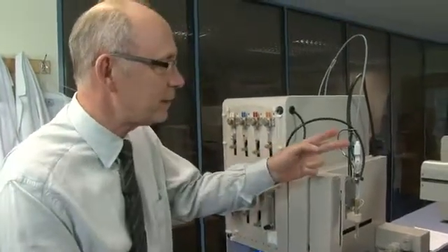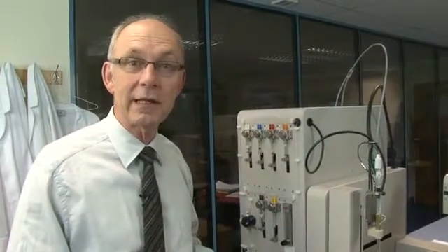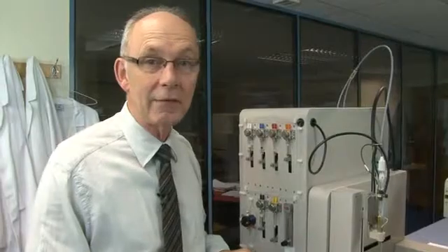We start with this one at the front with the white cap. This is a pH electrode. This is one of the smallest pH electrodes ever made. It's made specially for us and we need very accurate measurement during these titrations in very small volumes.